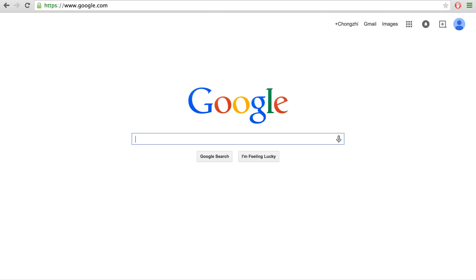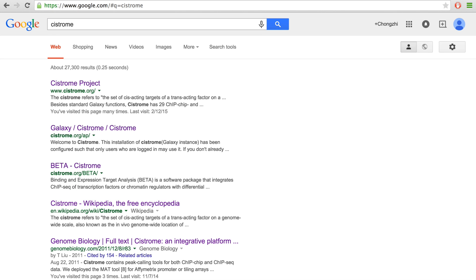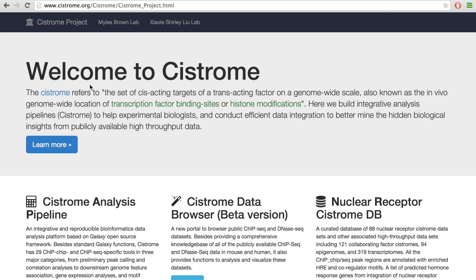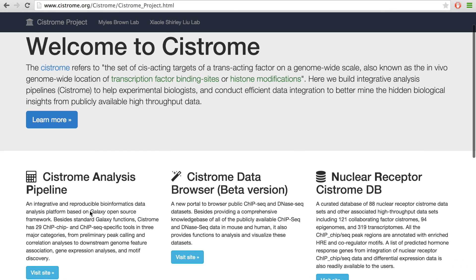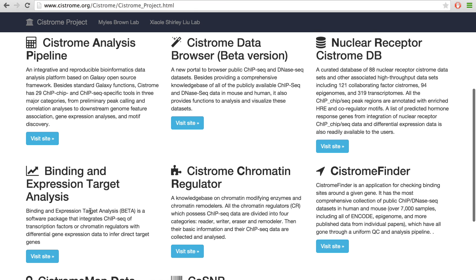Now let's take a look at what the Cistrome AP interface looks like. Simply Google Cistrome and go to the first hit for the Cistrome website. We can see the Cistrome Analysis Pipeline shown on the top left panel. We also have a few other projects for public data collection, integration, data browsing, and data mining that you are welcome to try. But now let's go to the Cistrome Analysis Pipeline website.